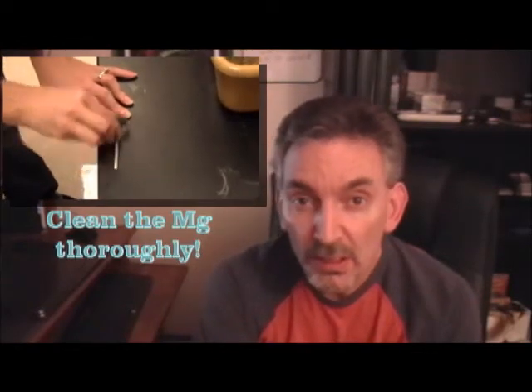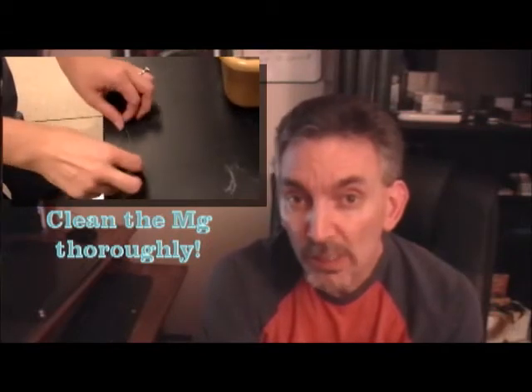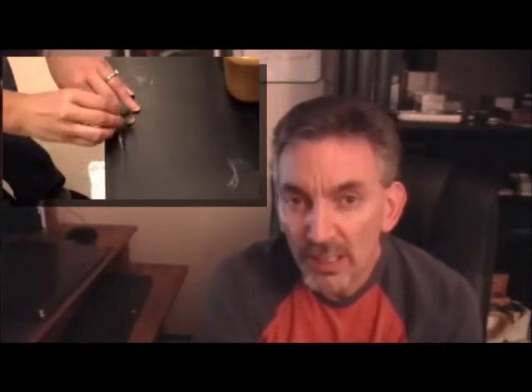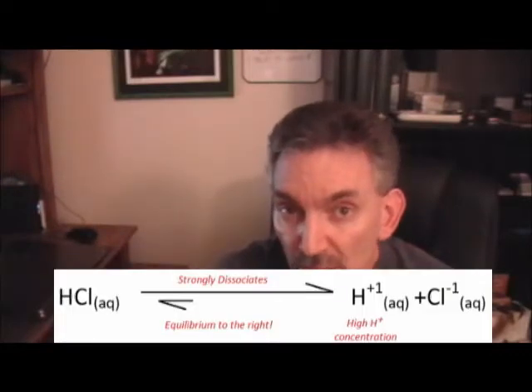So the first part of your experiment is looking at the nature of the reactants. You would take that strip of magnesium each time and dissolve it into a variety of acids. Now that magnesium is reacting with the hydrogen ions in the acid, but not all acids are created equal. Some acids are stronger than others. Some acids more fully dissociate to give hydrogen ions.